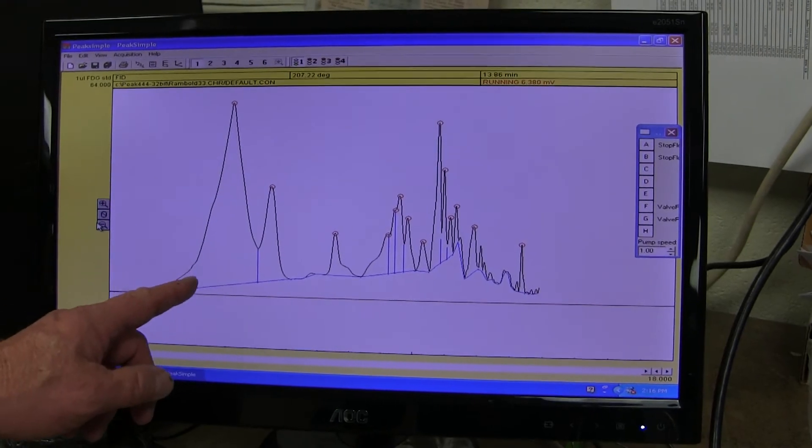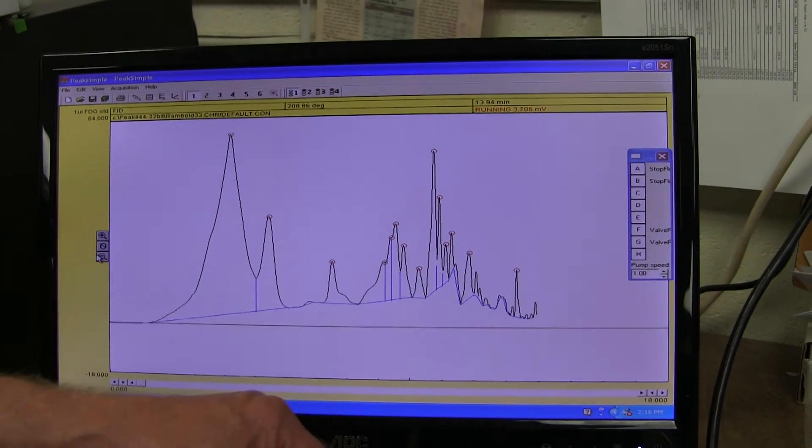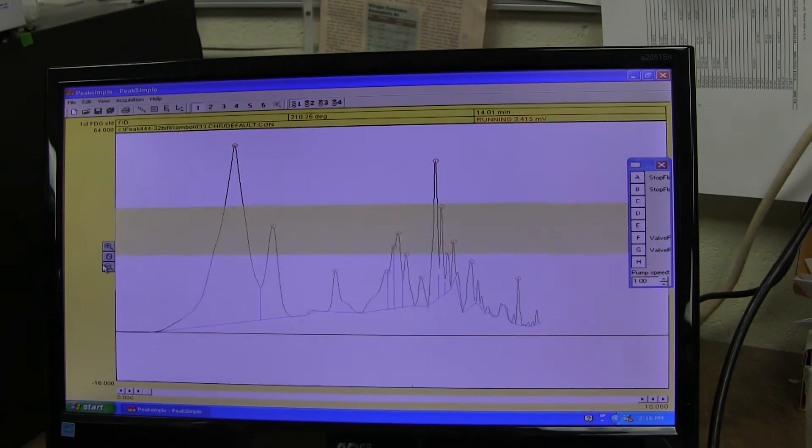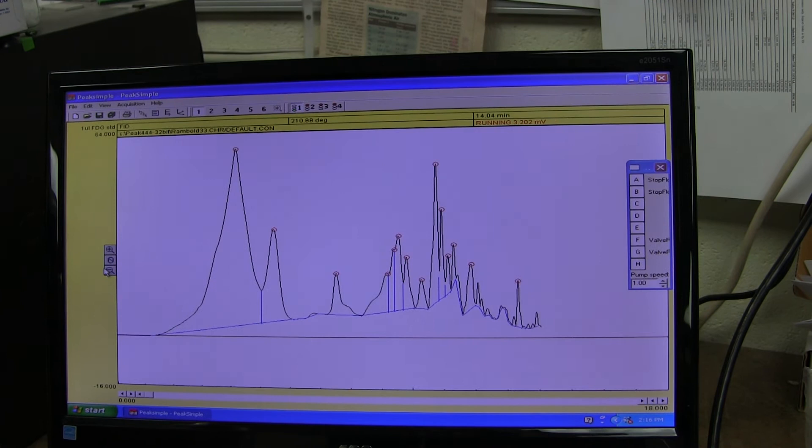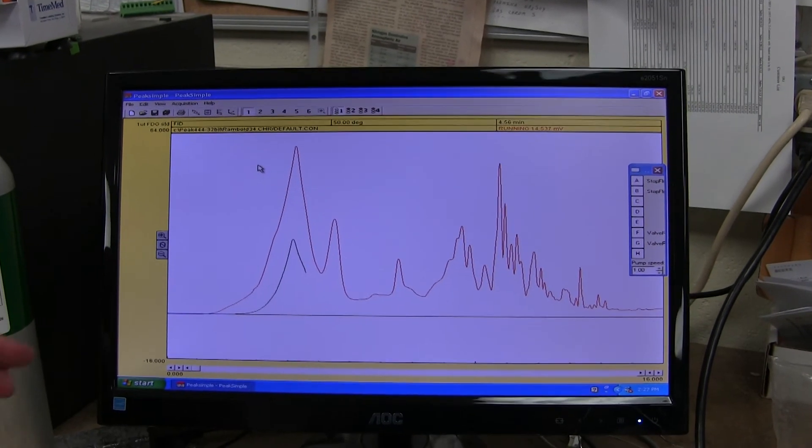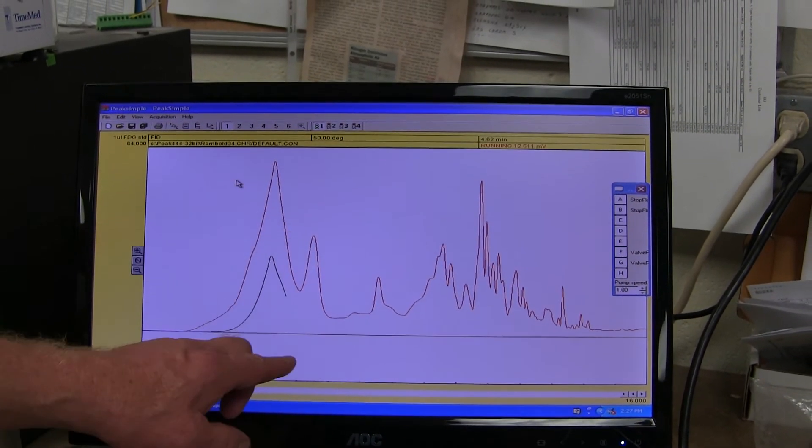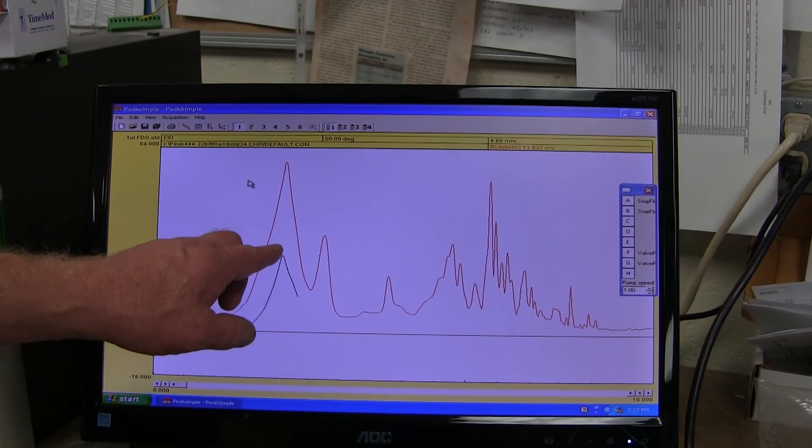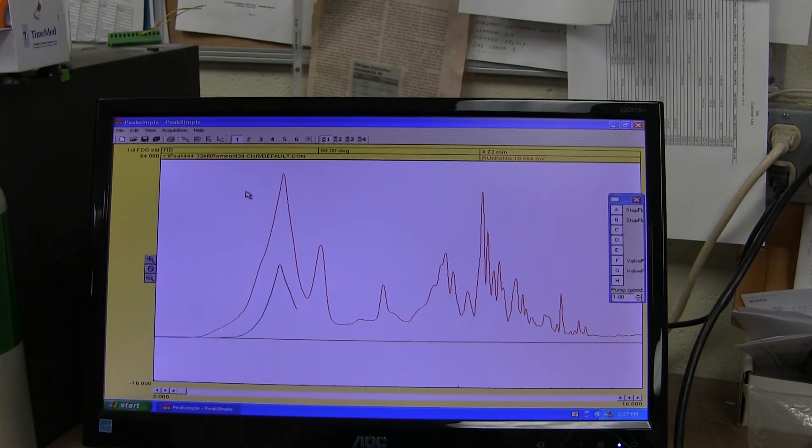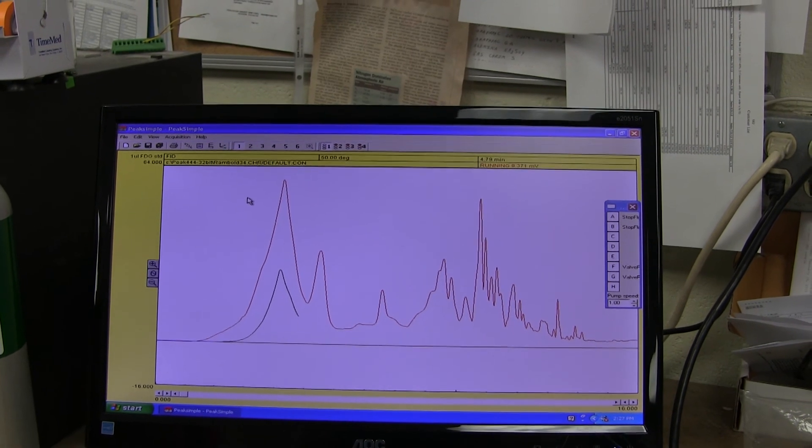An example of a really dirty polishing filter. Look at all these peaks that came out of that polishing filter when we heated it up. Just a ton of them. So this was a polishing filter that really needed to be baked out. The red is the first bake out of the polishing filter, and this black line is the second bake out. You can see that the polishing filter is dramatically cleaner on this second heating than it was on the first.